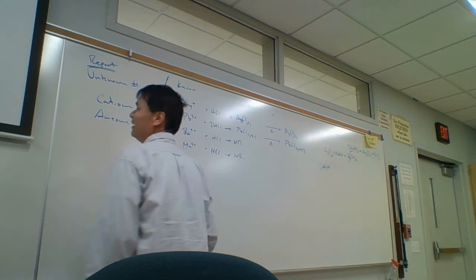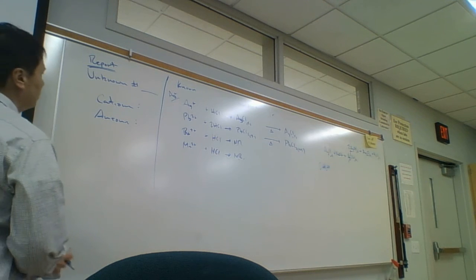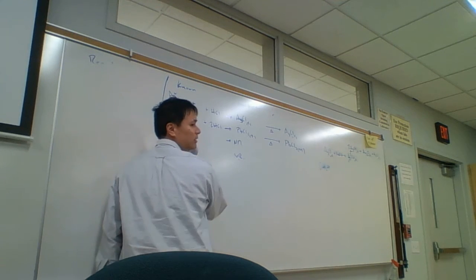Okay, let's move on to the test for lead. And so you'll just write this on, let's say, loose leaf paper or sheet of paper or something.